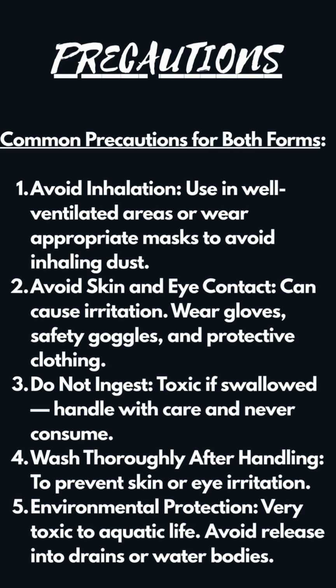Hydrated copper sulfate has similar hazards. It is also harmful if ingested and can cause skin and eye irritation. Although less reactive than the anhydrous form, it should still be treated with the same level of caution. Use personal protective equipment at all times and wash your hands thoroughly after handling. Proper understanding of chemical safety helps prevent accidents and ensures a safe laboratory environment for all participants.